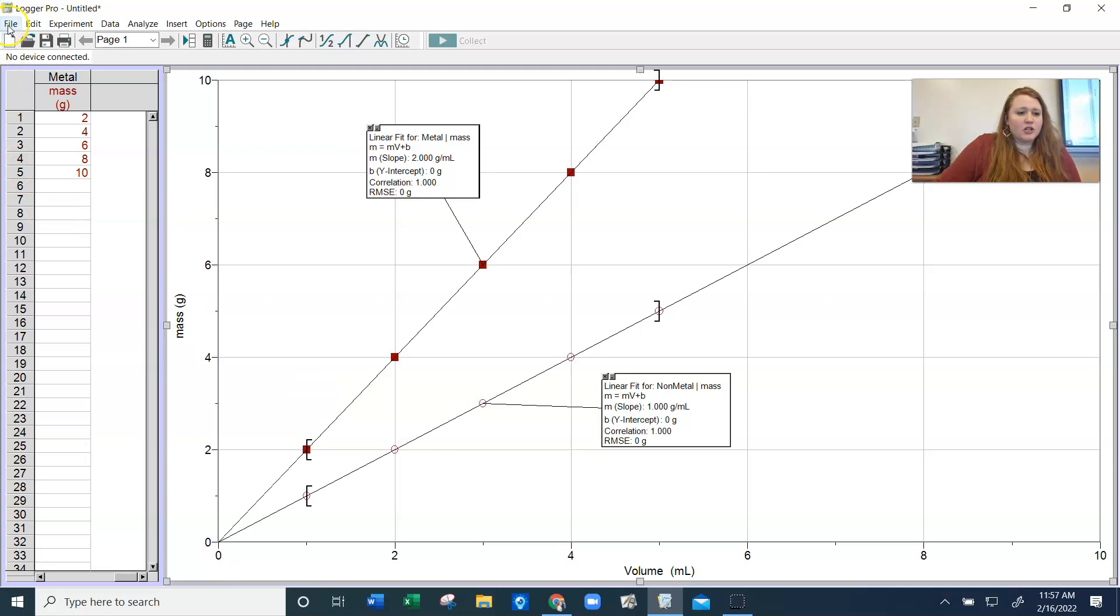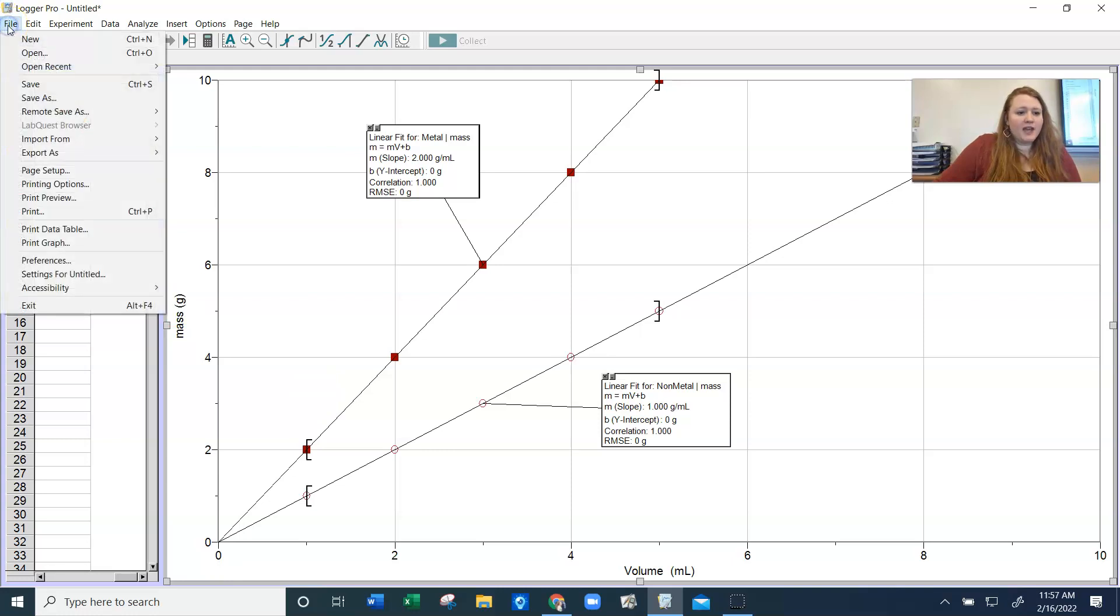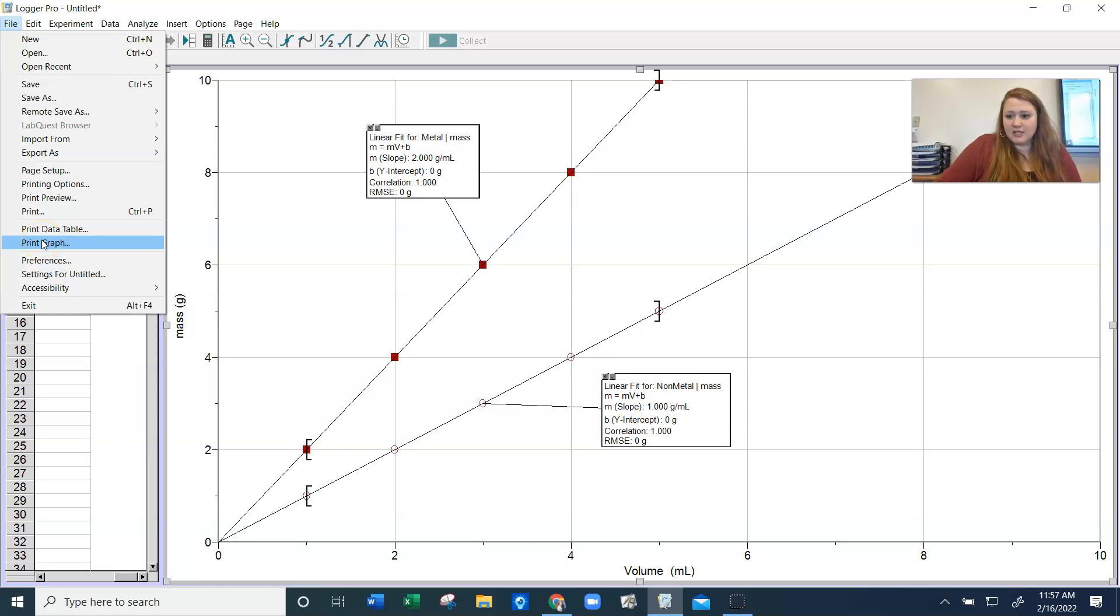You're going to go to File, and then Print Graph. And you should be able to send it wherever you need to send it.